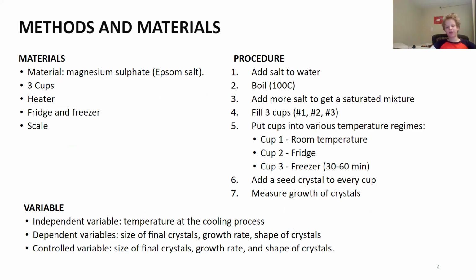Then we put the cups in various temperatures, one in room temperature, the second in the fridge, and the third in the freezer. Then we added a seed crystal to every cup. Then we measured the growth of all the crystals.